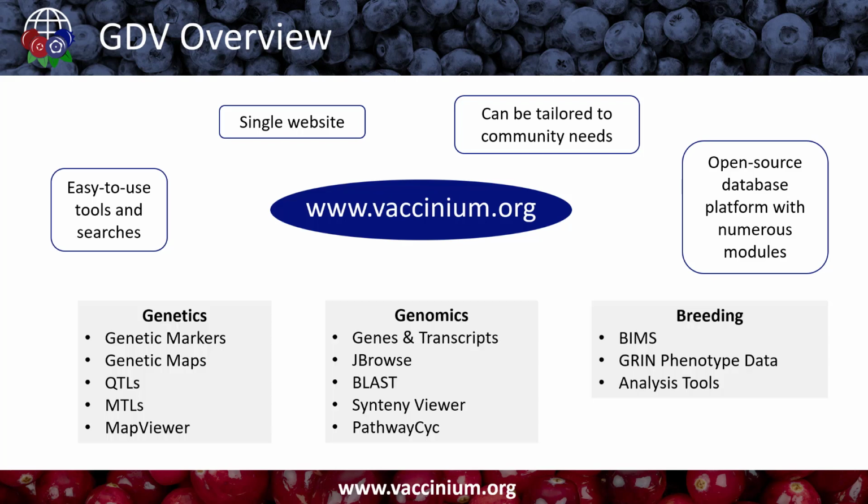modules available. As far as data, we curate genetics data from published manuscripts, and we curate genetic markers, genetic maps, QTLs, and MTLs. We have a tool for viewing genetic maps called MapViewer, which I'll cover later in this presentation.